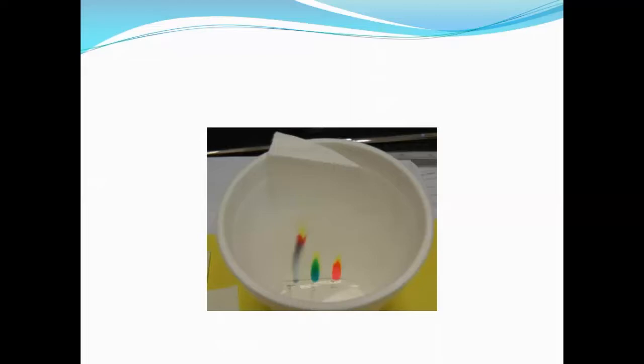The solution must not exceed the level of the origin line that you have made here. This is the origin line, so the water must not exceed this level.